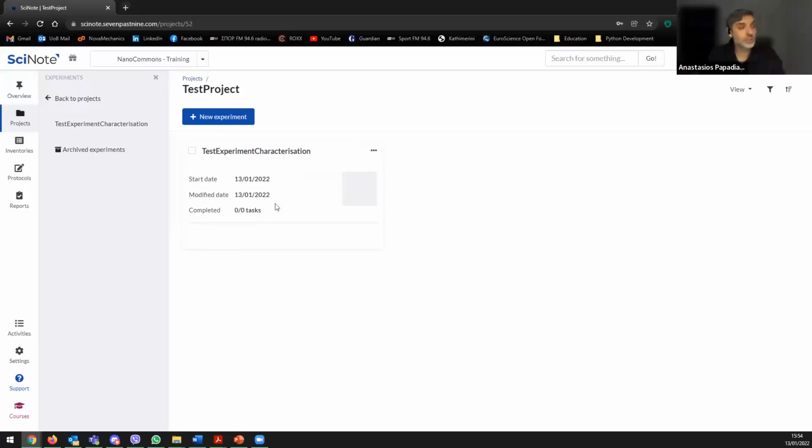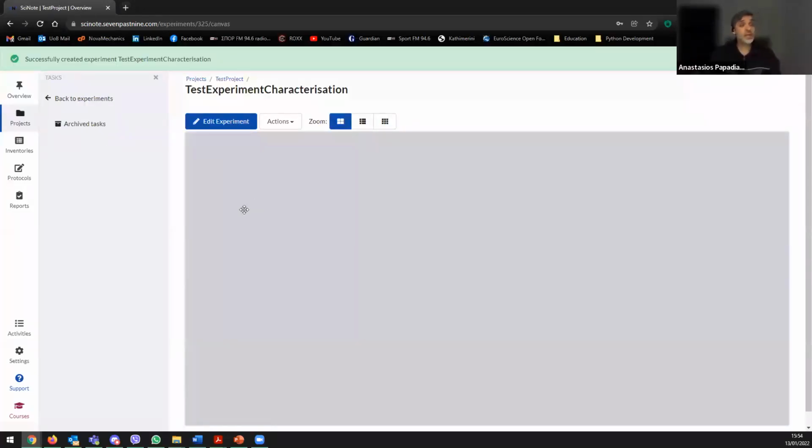So when you create your experiment, then if you go in, then more or less the fun begins. You start then inputting your experimental process, etc.